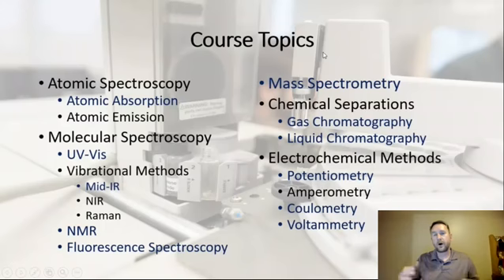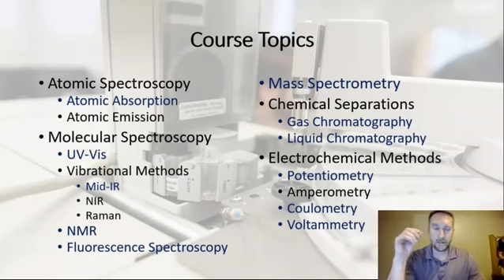As I noted, there are a lot of topics associated with this particular course, nearly all of the chemical instrumentation that we have available at Missouri Western we address in this course. In the classroom, of course, we're talking about the fundamental aspects of it, the theory associated with it, certainly the experimental aspects of it, but in the laboratory is the student's opportunity to get in and use this stuff.